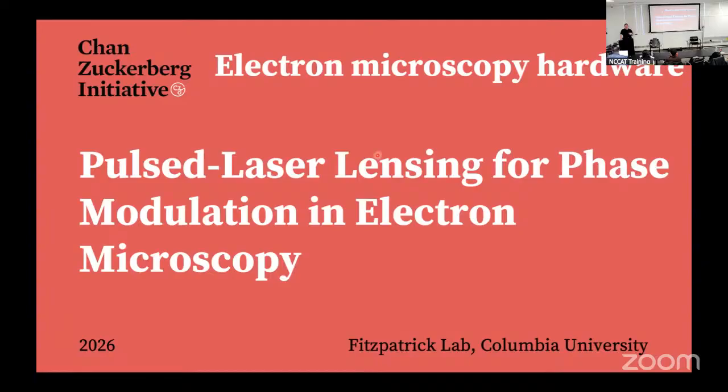That said, one of the bigger challenges for all of us is going to be to get that same kind of detail and contrast and resolving power in tomography. I'm not sure how much you've done of tomography yet, but for a lot of us, as Ed was mentioning, what's the most robust part of this process? I feel like single particle at this point is pretty good.